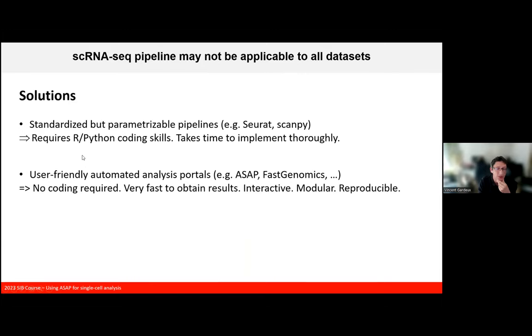Bioinformaticians are using other solutions. I told you about them already, like Seurat or ScanPy. So Seurat is R based and ScanPy is Python based. Depending on the language you use, you will prefer using Seurat or ScanPy, but basically the analysis pipeline for both of the frameworks is the same. The steps are the same, the architecture, everything is the same. Of course, the limitation is that it requires R and Python skills. So it takes time to implement thoroughly.